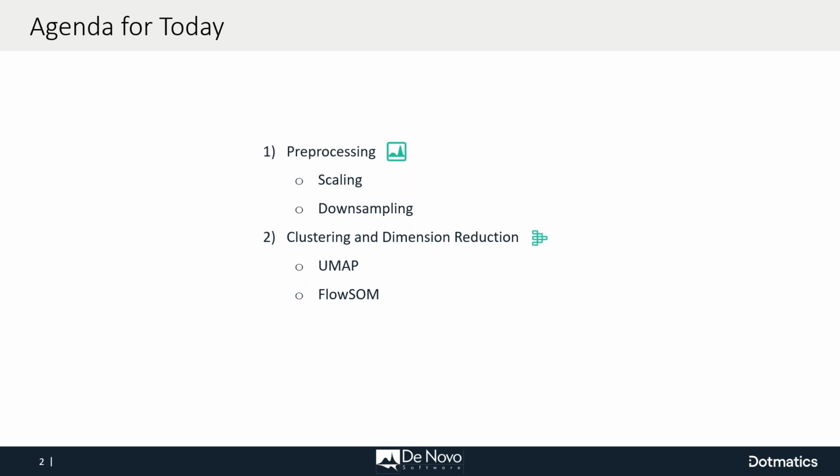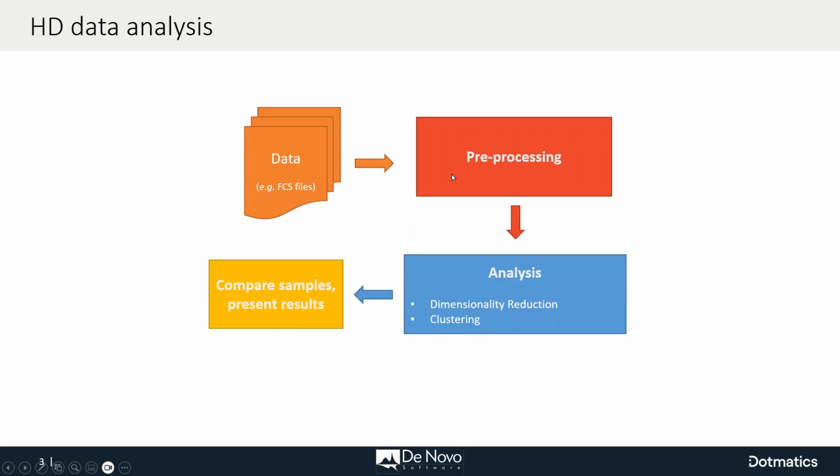So what Jeff and I would like to do today, together with you, is go through some real data examples and play a little bit with the parameters and the variables that are involved in each of those steps. Again, feel free to find your way to the question section of the GoToMeeting webinar dialog. Feel free to type the question that you want. At the end, we will answer your questions live.